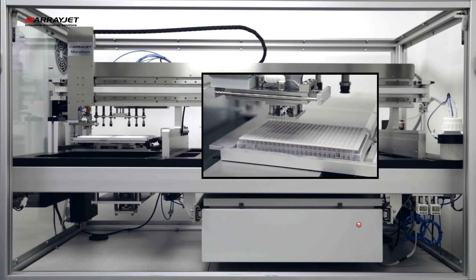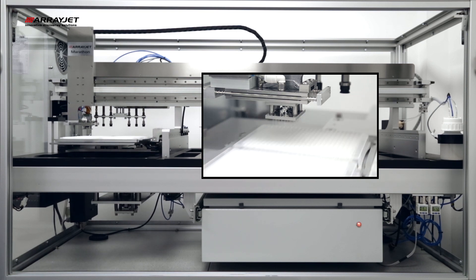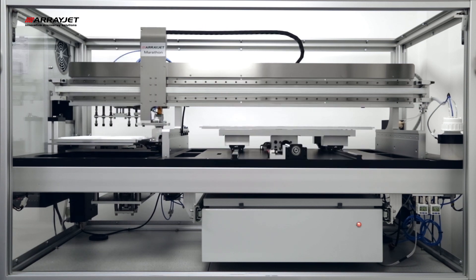It is possible to aspirate from plate wells containing 5 microliters or less of sample. After sample loading, the JetSpider is returned to its wash station and the printhead is prepared for printing.